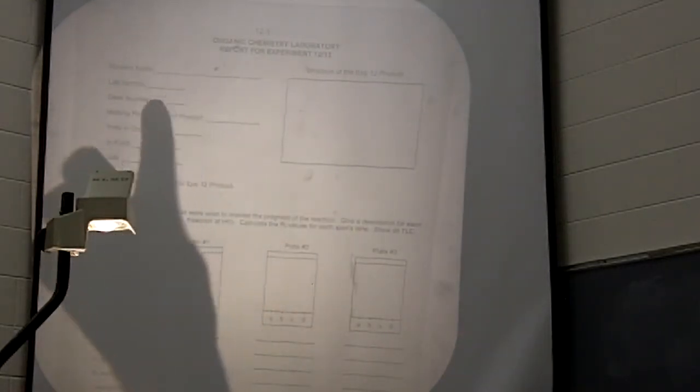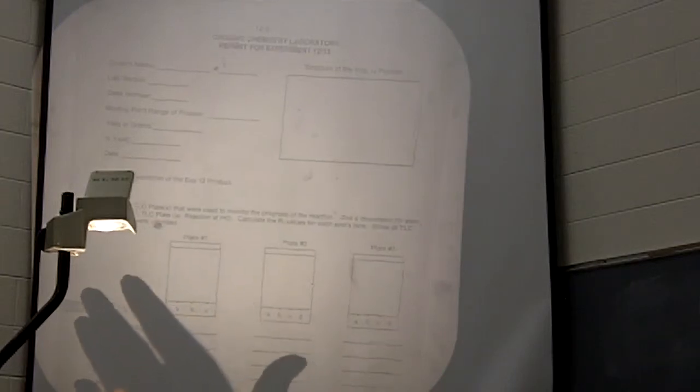So I want to go over the report form you have in the back of your experiment 12, just like experiment 4. I want to go over that quickly, and then I have some information for your pre-lab that'll help you fill out your physical data table. So for experiment 12, you're going to fill out all this information: your yield, percent yield, melting point range of your product, and draw the structure of your product. Everybody should have the same structure. No unknown this time.